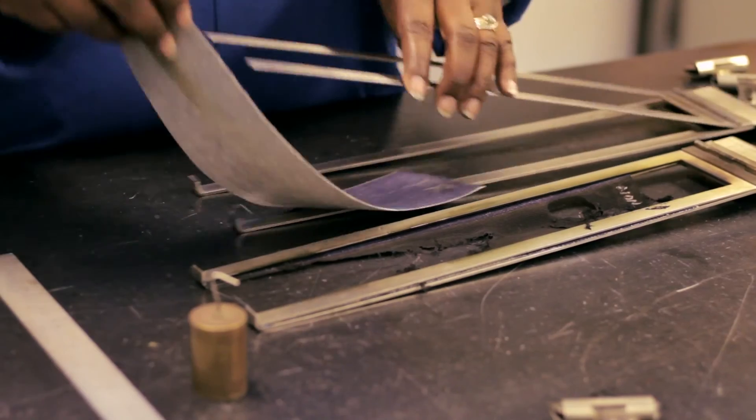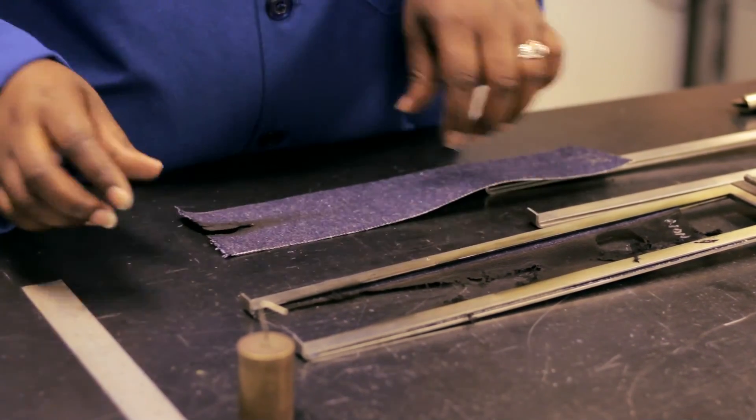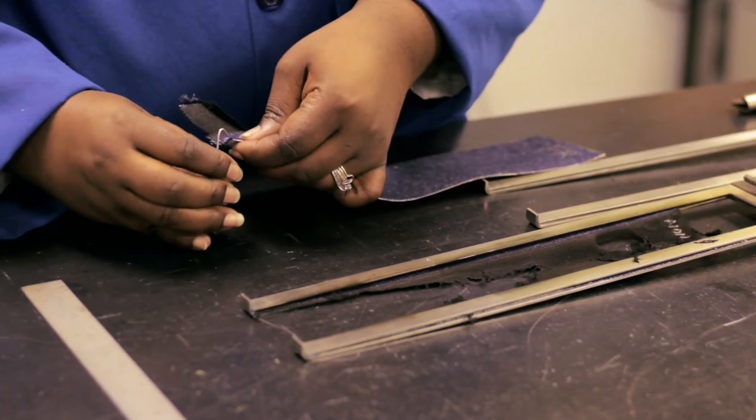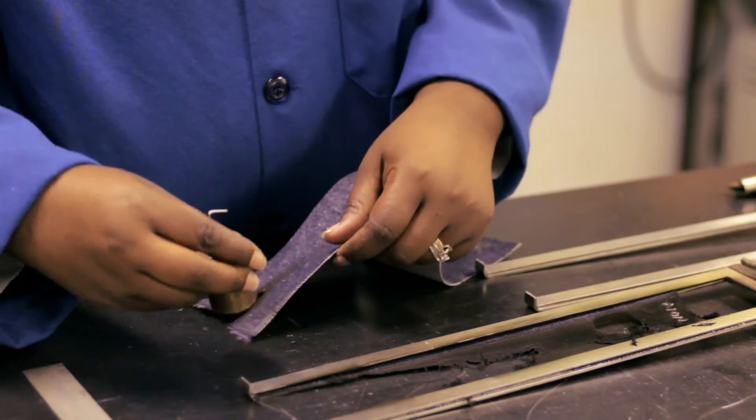Next, we'll measure Char Length. Char Length is measured by removing the specimen from the frame, folding it over to crease and tear the burn area, and applying a standard weight to the fabric to see how much of it will tear.